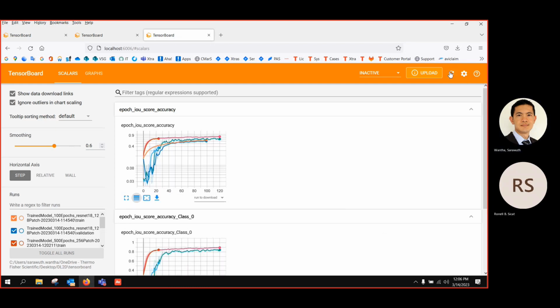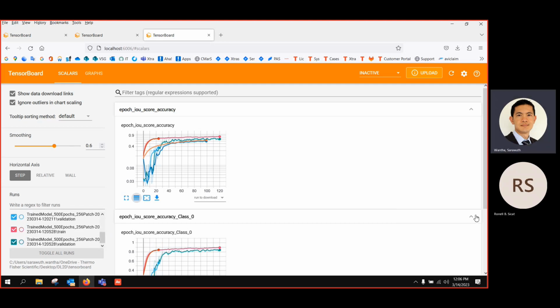One question, kind of related: I see that all the models and all the training is running very fast. So do you need a high-end computer? Do you need a really powerful one to run? Yeah, at least we need a moderately new CPU like an Intel Core i7 or i9, with at least 3.5 gigahertz clock speed.